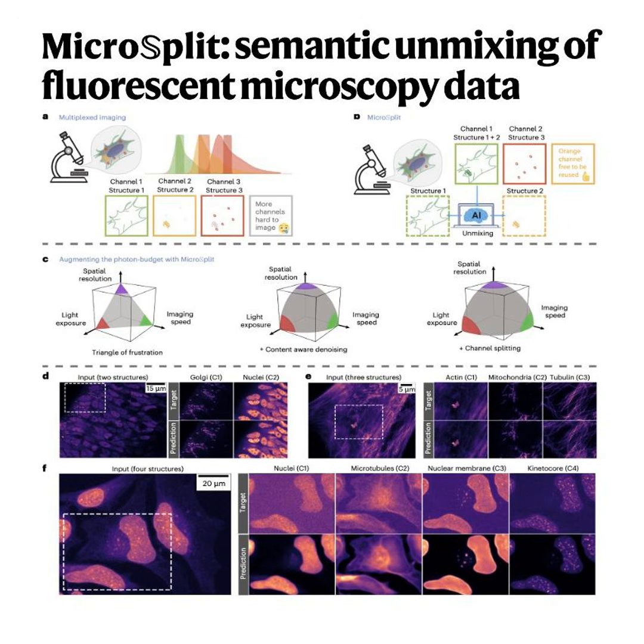If the structures you're analyzing have totally random, unpredictable geometry every single time you look at them, the network struggles to build a reliable model. It doesn't know what it's supposed to be unmixing. Exactly. And finally, the fifth limitation involves size constraints.